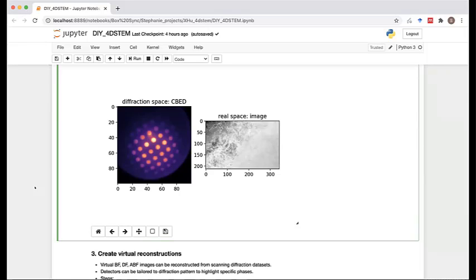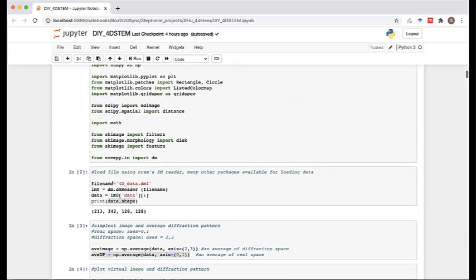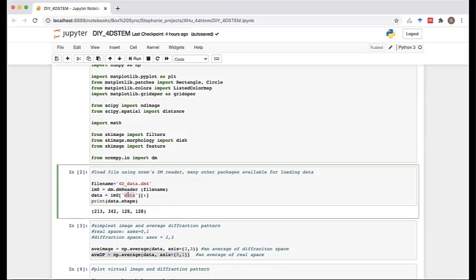If you maybe go a little bit up, instead of reading your EM data, there is another section that you can read, basically the metadata of that. So yes, it is accessible. That was the question. Yeah, exactly.